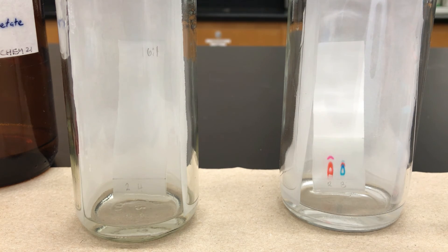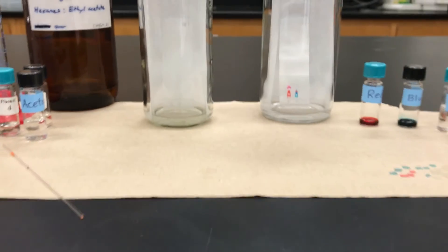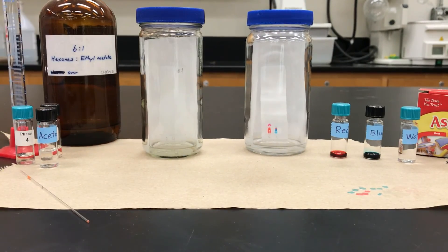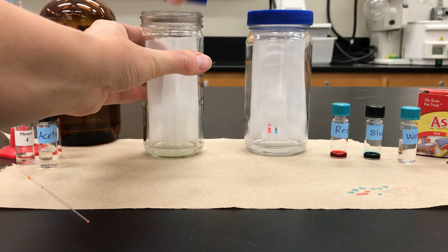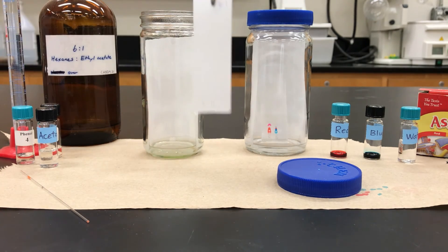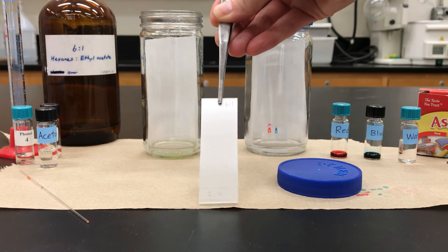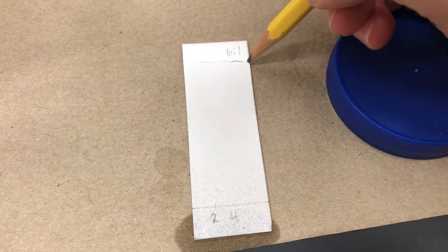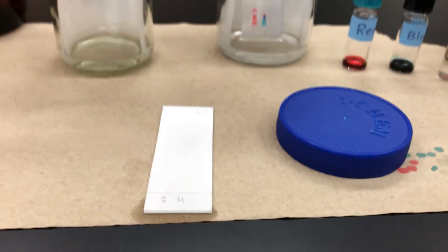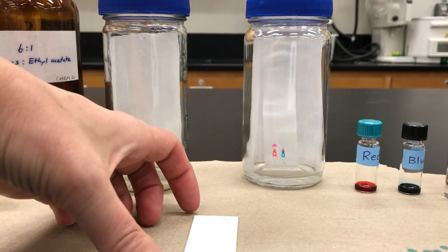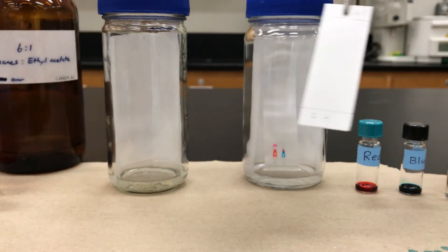The solvent front on the TLC on the left is nearly to the top, maybe a centimeter or so from the top. And so I'm going to take it out. So you open up the jar, get your forceps and pull it out. If your solvent is somewhat nonpolar, it's going to evaporate pretty quickly, which means you need to right away take a pencil and mark the top of the solvent line because it will disappear on you.